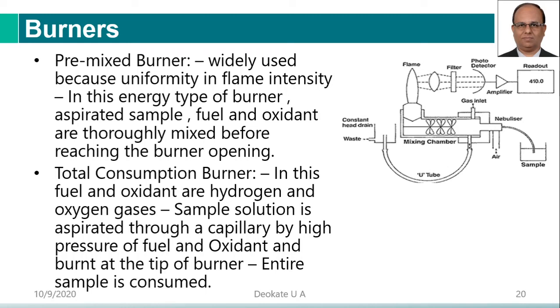I will explain how it works. See here, this is the premix burner system. This is a premix chamber. It is provided with mixing blades, or these can act as a baffle also to take out the larger droplets. There is a small capillary, and this is the nebulization system where a small nozzle is fixed. When the air and fuel gas pass through this nozzle, they create a vacuum here, and this vacuum will suck the liquid or sample, and when it comes out through this nozzle, it will be converted to small droplets here.